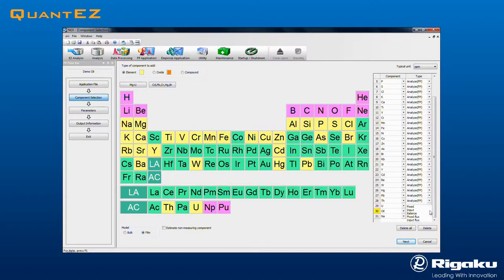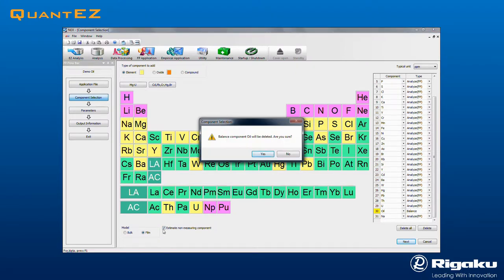For Dirty Oil, Scattering FP may be enabled by simply selecting the checkbox estimate non-measuring component, in which case the software will determine the percentage of the sample that is the balance.